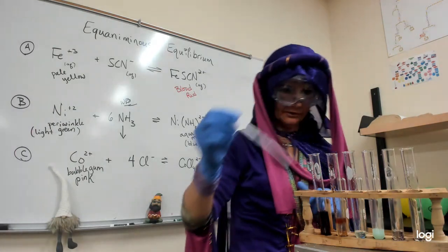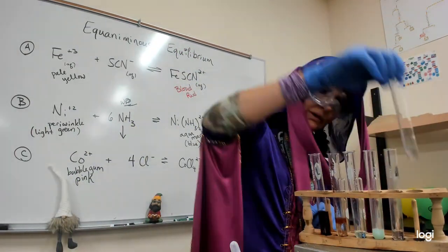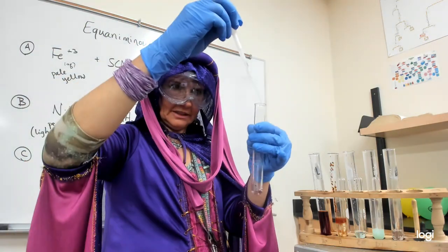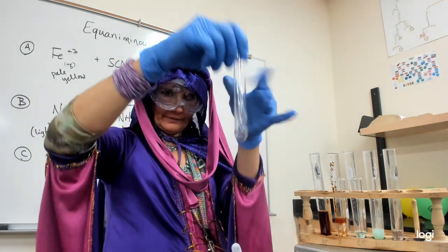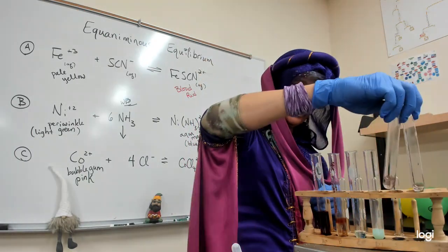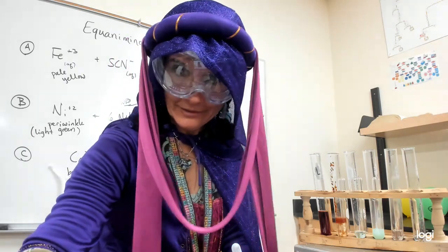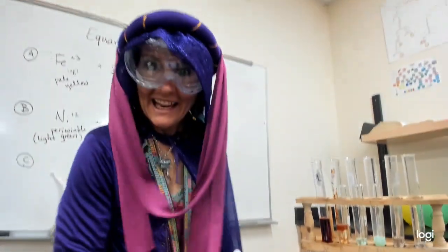This is usually where I'll come over and talk to you and distract you and see. So we kind of got it. You know, I'm feeling like my 12 molar is not 12 molar. Let's add 12 more drops. I go through this with the lab. All right, we're going to put you on pause. I'm going to go find another bottle of 12 molar HCl. It was set up. Oops, doing pause, pause, pause. I can't pause with gloves on.